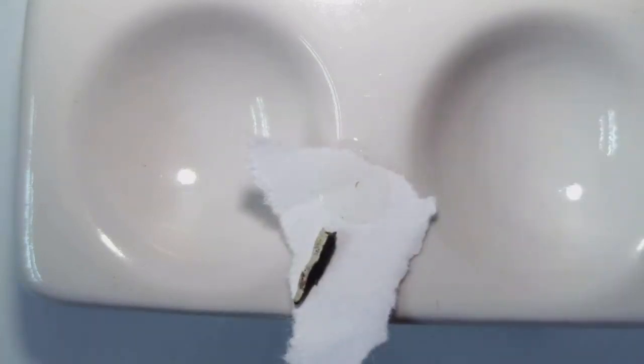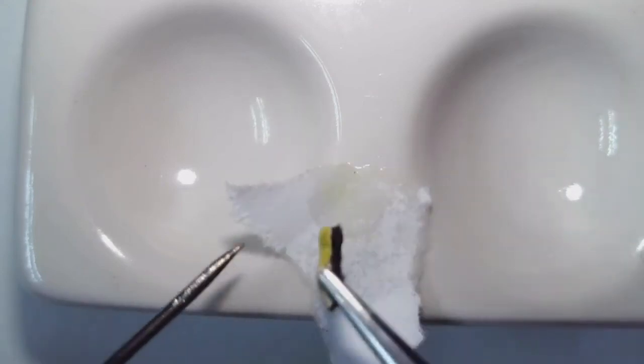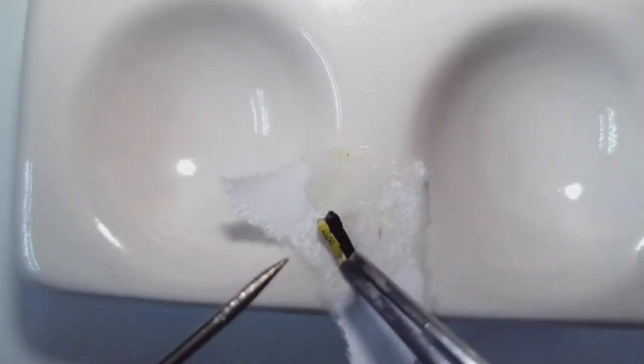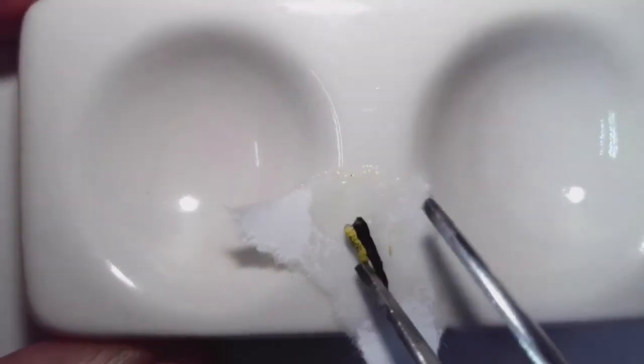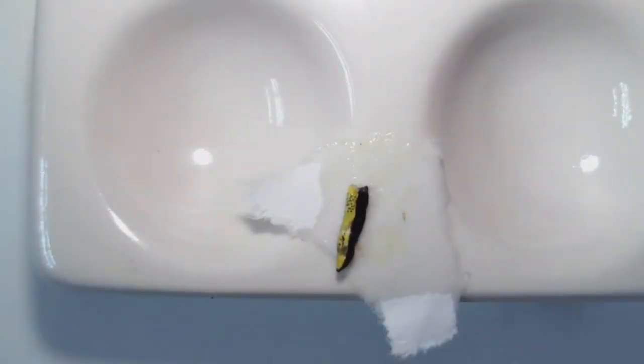Okay, so let's do the K test on a specimen of Hypogymnia inactiva. We're looking for a K plus yellow reaction in the cortex. So I'm just going to again do a little drop of K, take my specimen and drop it on there and take it out, and then observe any color change. And so we can already see, if I can flip it that way, a clear yellow color change in that top portion of the thallus. So this tells you that atranorin is present on that K plus yellow reaction.